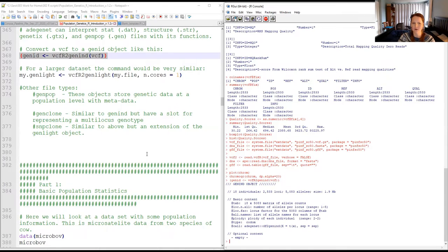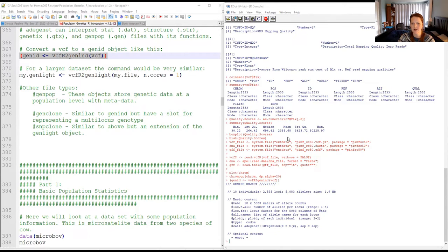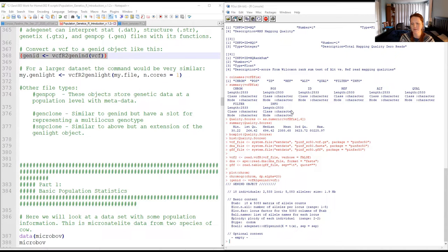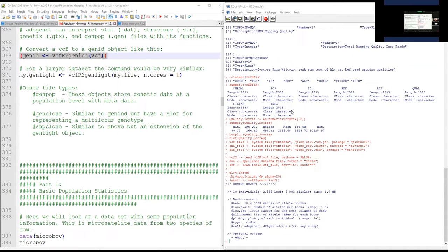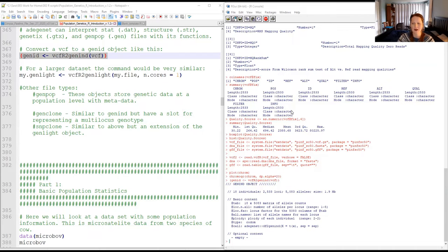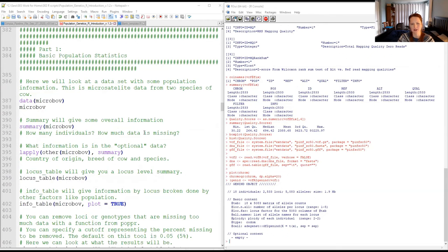That covers the basics of how you bring data in, start to interrogate it, check that it imported correctly, check quality metrics, understand what your data looks like, and then convert it into an object for further analysis. Are there any questions based on that? We'll move on to the next section on basic population statistics.